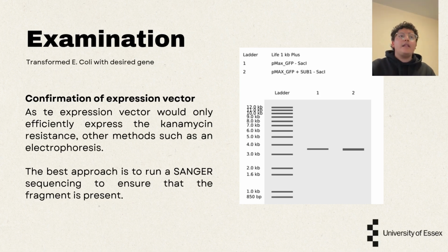To perform an E. coli transformation, a transduction of E. coli competent cells, we have to do another 3 steps. The first one is to incubate the ligation process, the resultant of our process from our previous steps. The second one is to perform a heat shock of E. coli cells for transformation. This is done maintaining them on ice and then at 42 grades Celsius for 30 seconds. And the third one is to culture them in agar plates with kanamycin.